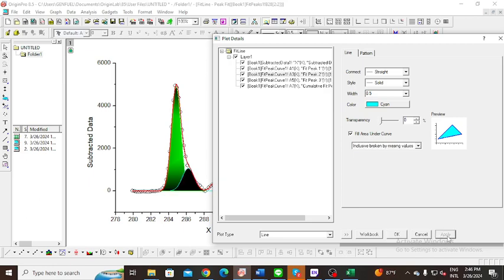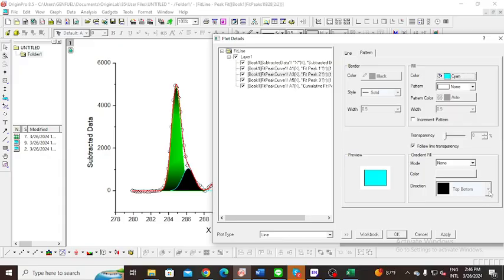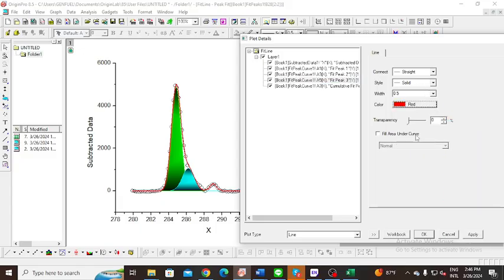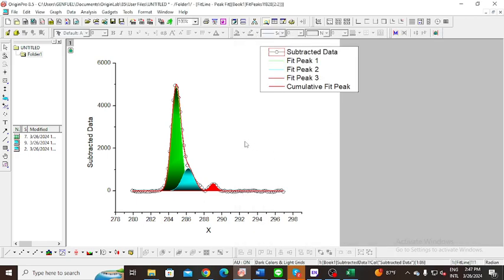No, the black solid pattern. This one. And also the same for the last, inclusive, the pattern. So it will be just like this actually, but we need to make it.